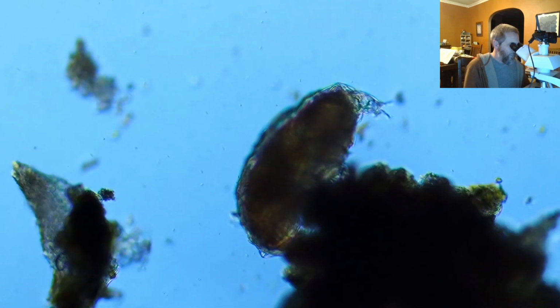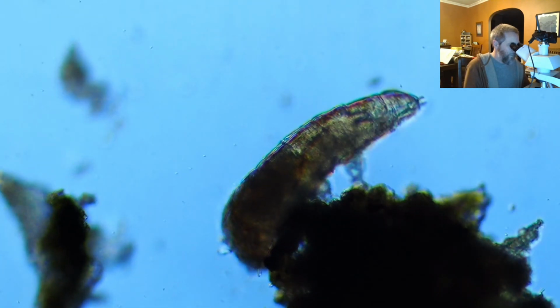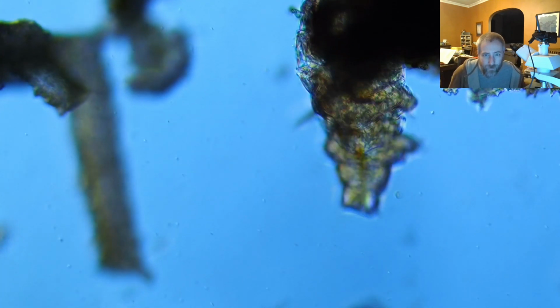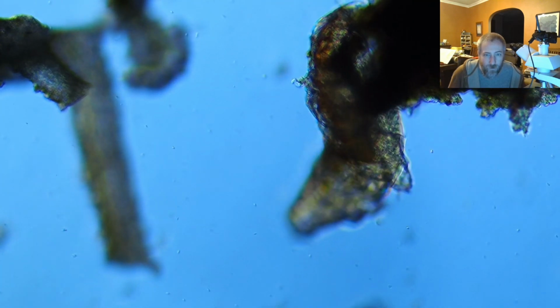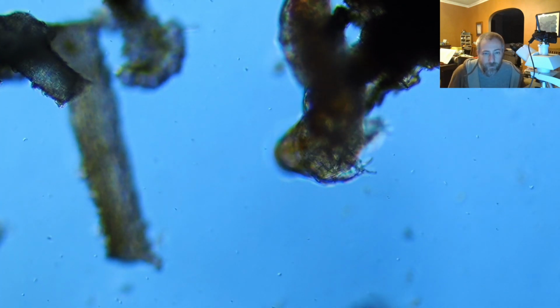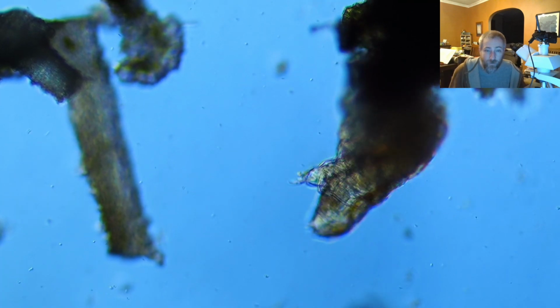So your question was, how can you tell the different species apart? In the scanning electron microscope, their characteristics are pretty distinct, and I would actually argue that probably a specialist could tell you from a light microscope for the most part. The shapes of their mouths, their heads, their coloration. Some of them, like this one, I think is armored. If you look at the exoskeleton, it's really heavy. Some of them have a transparent exoskeleton. But like all things, when you're trying to tell species apart, there's a combination of ways that you could do it.